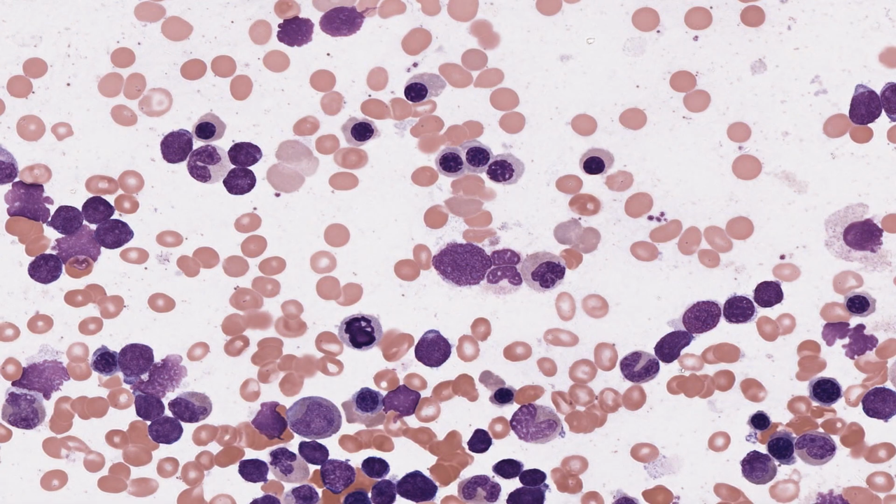The cell then passes to the stage we call an orthochromatophilic erythroblast, commonly called a normoblast. Orthochromatophilic means there's only one colour. And if you look at the cell, the cytoplasm has now more a pink to reddish tinge compared to these polychromatophilic erythroblasts here that have a lilac-coloured cytoplasm. The nucleus is very condensed now because the cell has become a lot smaller, on its final destination to be a red blood cell, only 6 to 8 micrometers in diameter. And the colour of the cytoplasm is more eosinophilic or reddish due to continual accumulation of the protein hemoglobin.